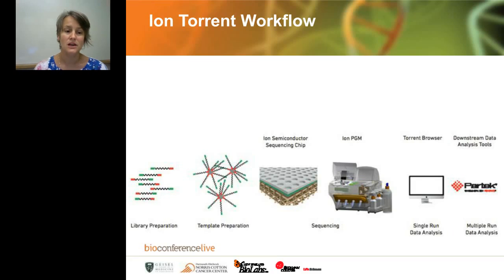The beads are then loaded into each well on the semiconductor chip, and then we perform the sequencing, which takes anywhere from 2 hours to 4 hours, depending on the read length. And then we're using the Ion Torrent browser and a number of downstream analysis tools to run the analysis.